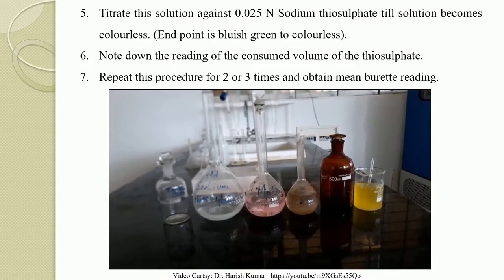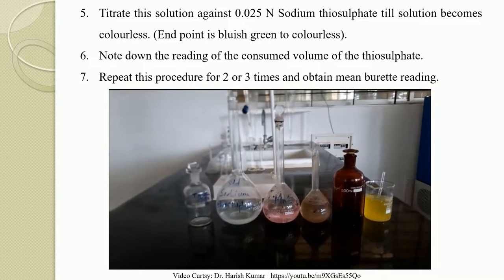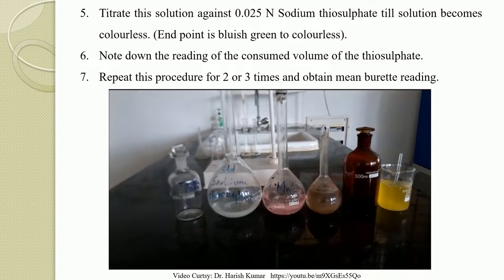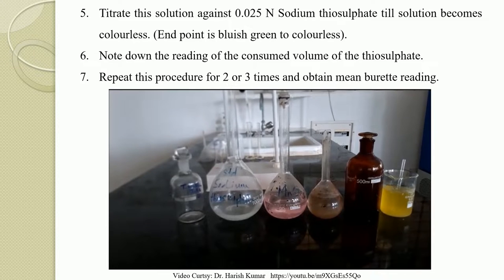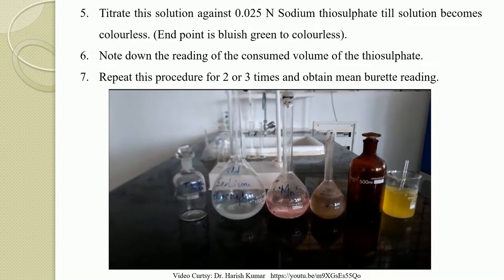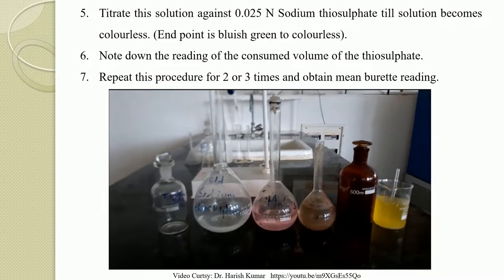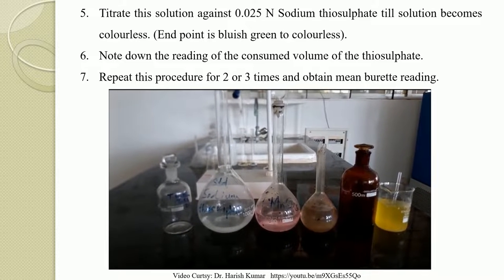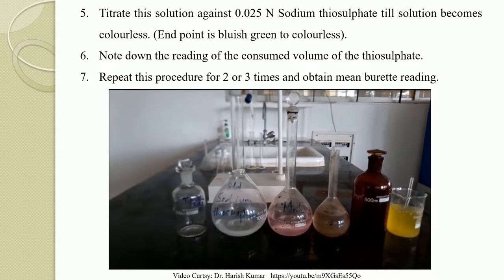So today we will be determining dissolved oxygen, that is DO. As you can see here, we have prepared the reagents beforehand as per the procedure given in the manual. The reagents are manganese sulfate, alkali iodide azide, and starch indicator, and we will be taking standard sodium thiosulfate in the burette, and we have taken concentrated sulfuric acid. All the reagents are prepared using the procedure given in the lab manual. As a sample, we will be taking STP water, that is sewage treatment plant water.